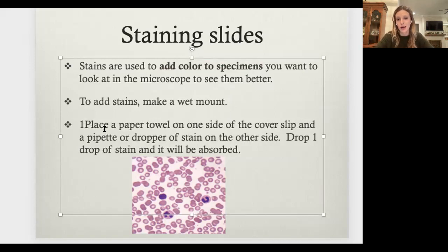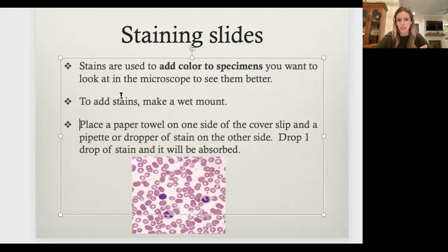You don't have to write down these steps. I just want you to know that staining slides means to add color to the specimen so that you can see them better. Okay, so just have that first bullet point down.